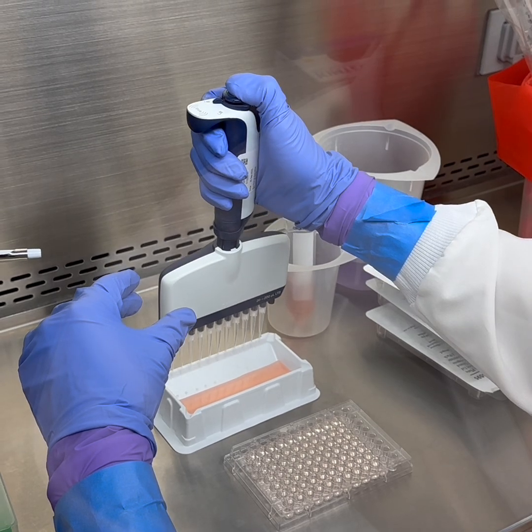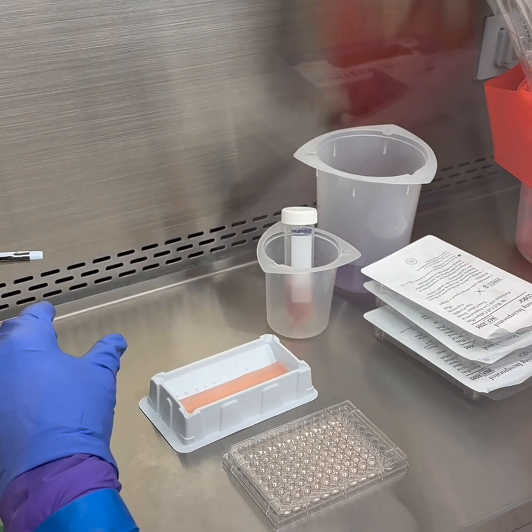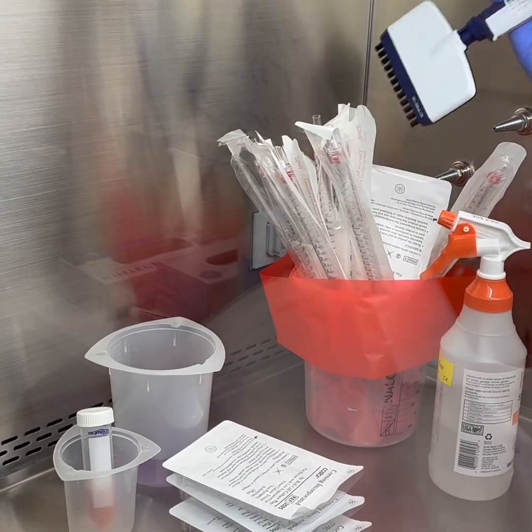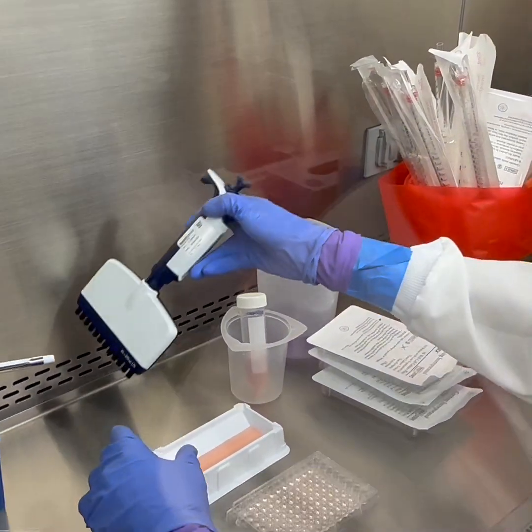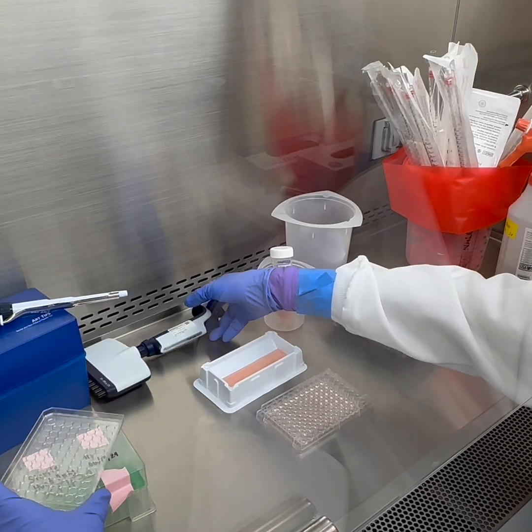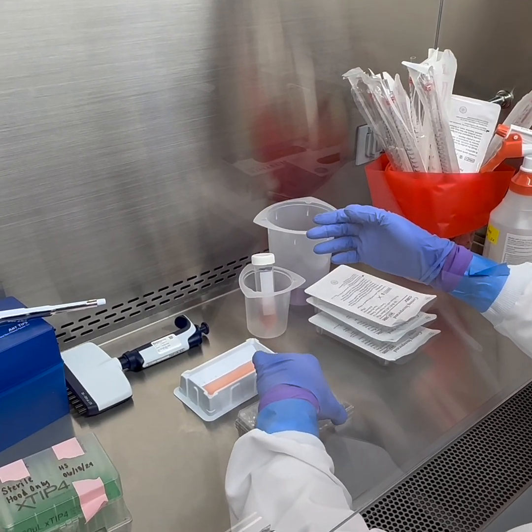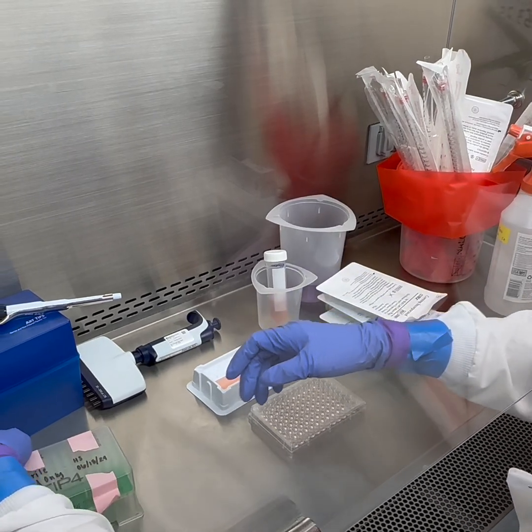And then after you're done, you should dispense your tips. Okay, cover the plate and seal with parafilm, and then incubate at 37 degrees Celsius for however long.